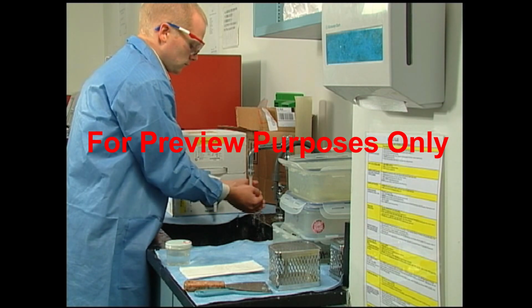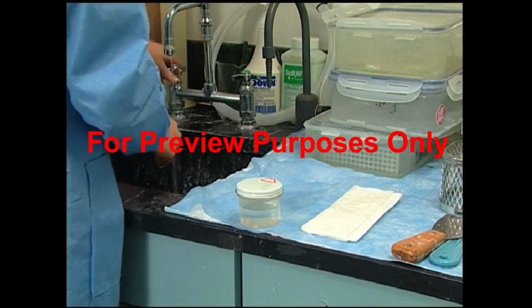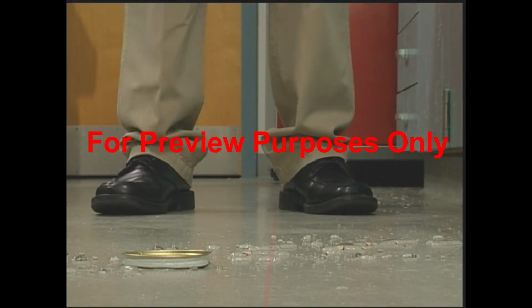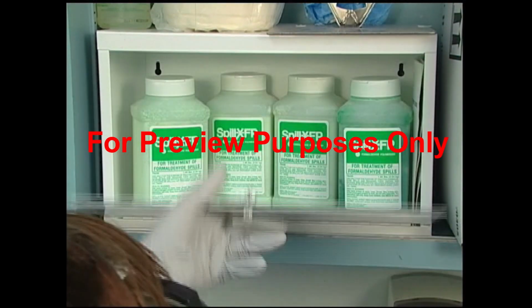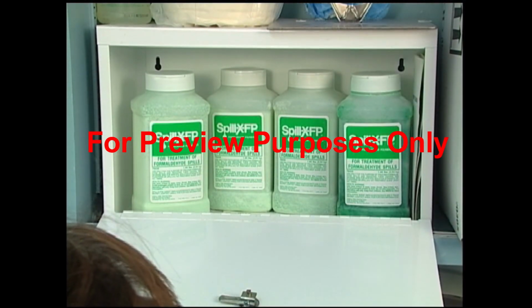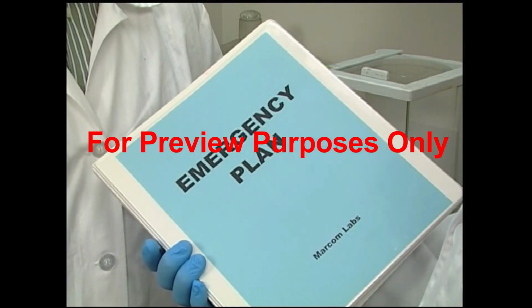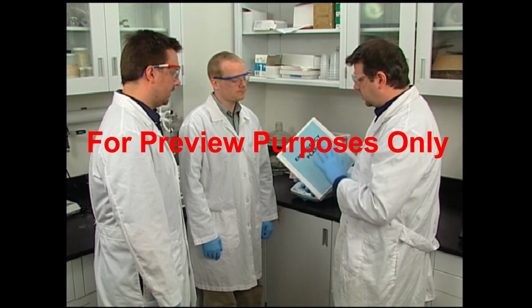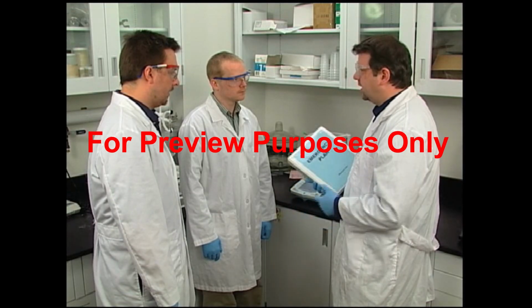Even if you've taken all the recommended precautions, you still need to know what to do in case an accident with formaldehyde occurs. No matter how careful we are, things can go wrong. You need to be prepared so that you can minimize the effects of any mishaps. To help you with this, your facility has developed a specific plan for dealing with accidents in your work area. But there are some things that should be done anytime an incident involving formaldehyde occurs.